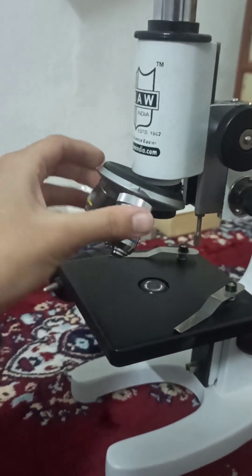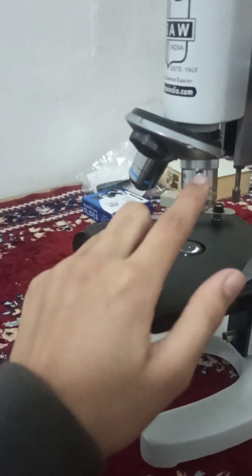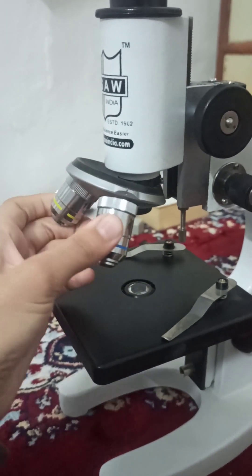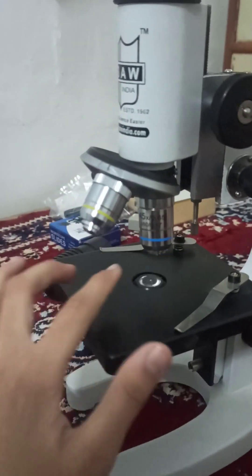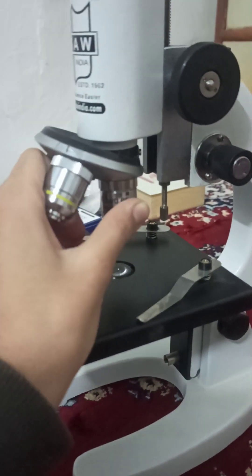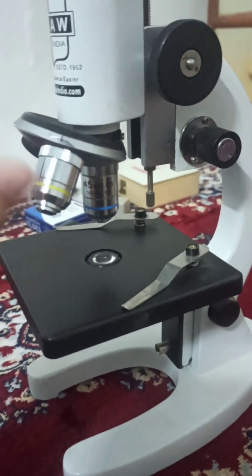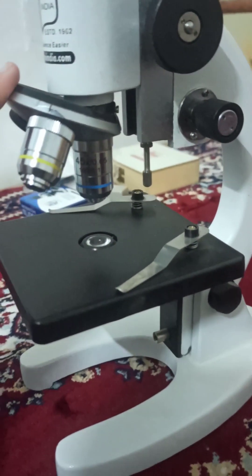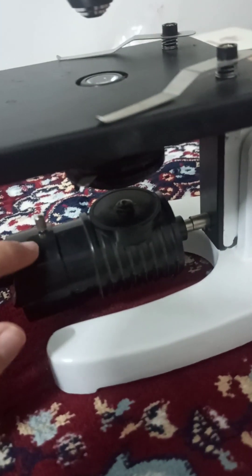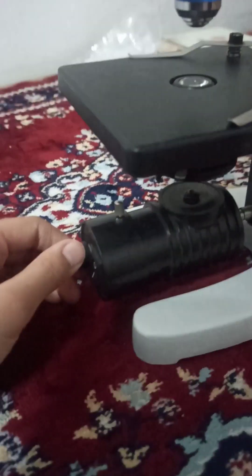We have two lenses here — this one is 25x magnification and this one is 45x magnification. We can also change their positions and select the one we want to use by just rotating this structure.